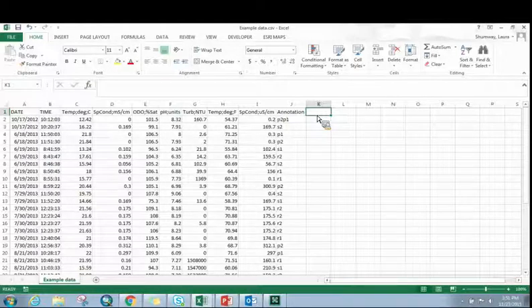So if you were collecting data with a probe, but you were also collecting data with a water bottle, those would be two different activity IDs. But every characteristic sampled under the probe would be under one activity ID. They would all be in the same one, as well as anything collected under the water sample that you took, the grab sample. So let's label this activity ID.